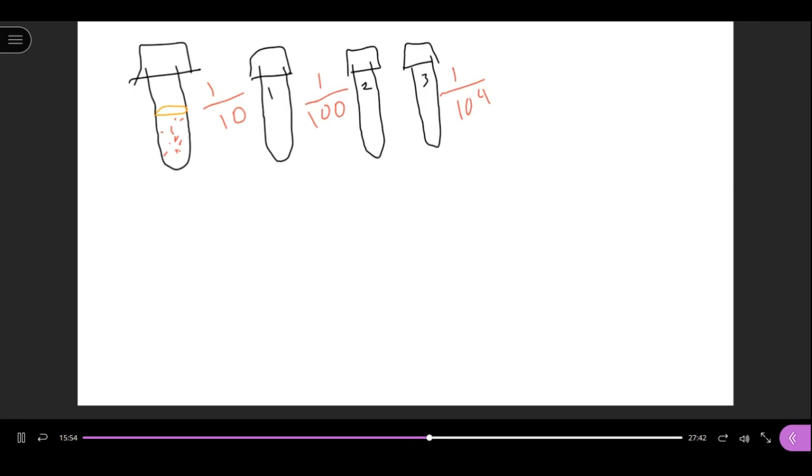Now the volumes plated don't have to be the same. So again, for the purpose of showing how this process is done using different volumes, we're going to use a different volume for each of the samples. We're going to plate using different volumes. I understand that in the lab report, the same volume is being used just to simplify things, but you should understand how this works regardless of what volume is being used.